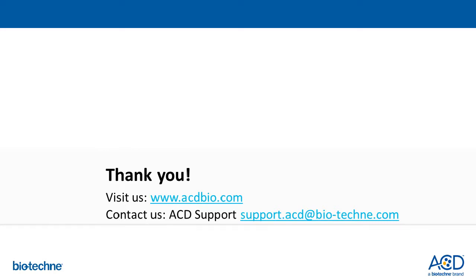So our first question, and this one is for you, Paul, asks: do the monocyte cell types you see in the scRNA-seq data correspond to those in the literature? Right. Yeah, I'm happy to answer this question. The question being, do the monocyte cells that we are finding in the single cell RNA sequencing data from the dissociated tissue correspond to things that are already known in the literature?